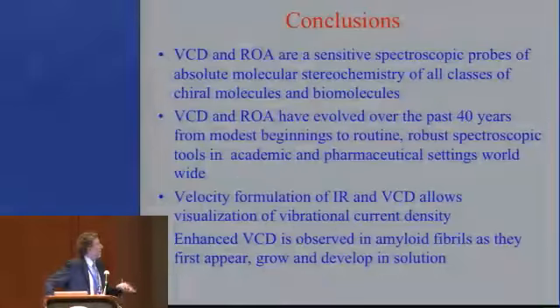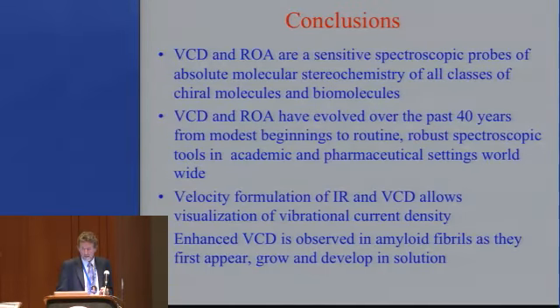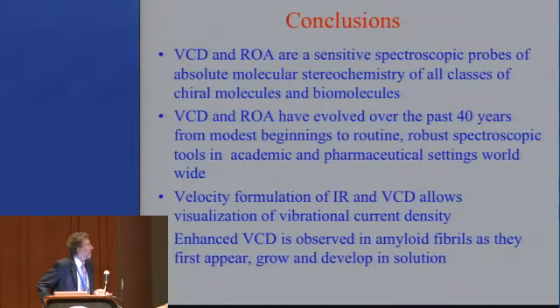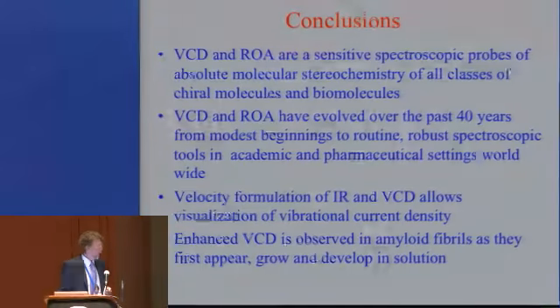So I'm just going to close with the following conclusions, that VCD is a sensitive technique for all kinds of classes of molecules. VCD and ROA have evolved over the past 40 years from modest beginnings to routine spectroscopic measurements in academic and pharmaceutical and other areas. I showed you a little bit about ROA and a little bit about enhanced VCD.